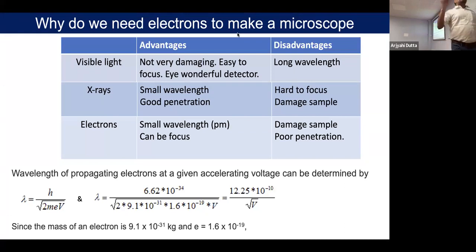Now, as I mentioned, in the early days, even in the last 7-8 years, I faced a lot of problems like that. You can use lower voltage for a biological sample. You cannot use 300 kV for a biological sample. But 300 kV is good for a biological sample because your lambda will be smaller and penetration power will be much higher. And that is the reason that for most cryo microscopes in good condition, people are talking about wanting a 300 kV microscope.